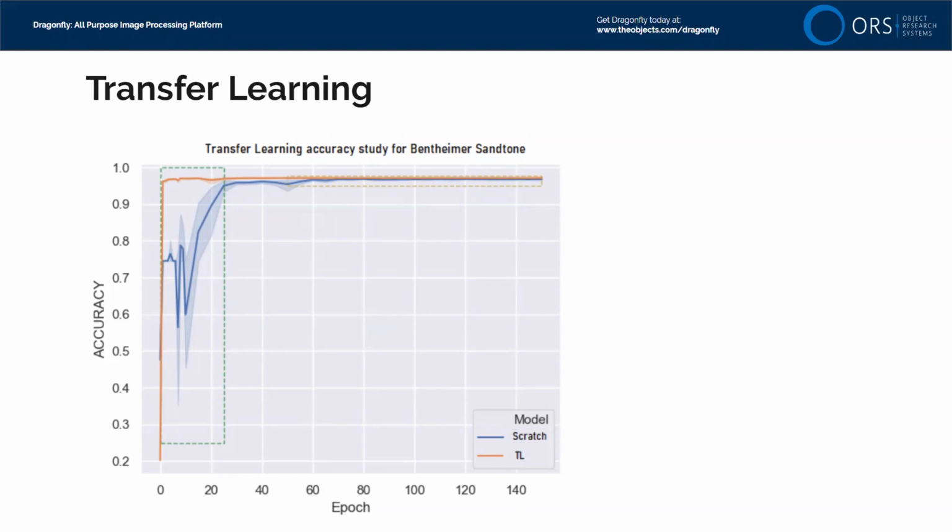What we've done is we've trained, for example, a model that can segment grains in rocks. We've trained it on a library of rock samples where it has encountered some carbonates and some sandstones, and even some shale rock samples, and it's looked at them at different scales. And we've trained that model to do a decent job at segmenting foreground grains from background pore space.